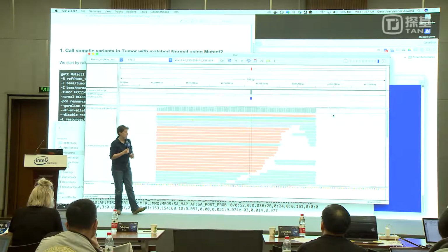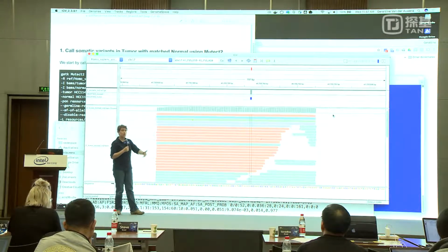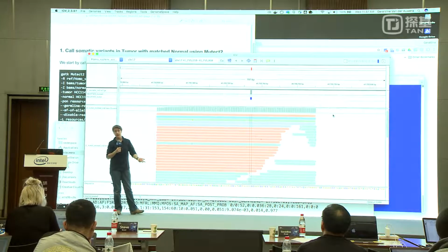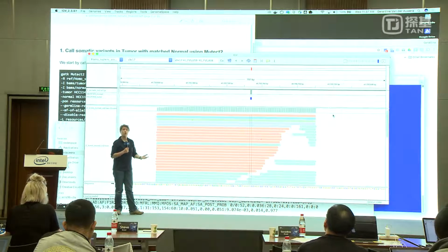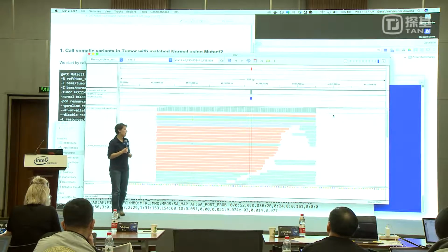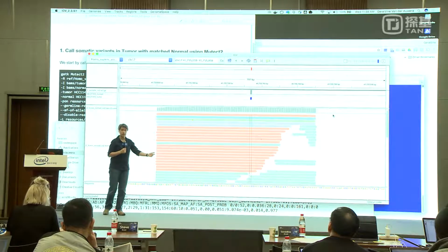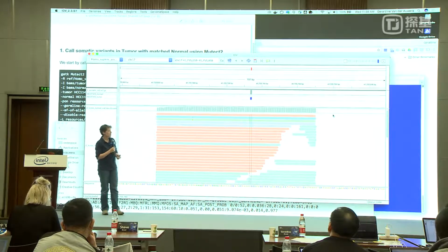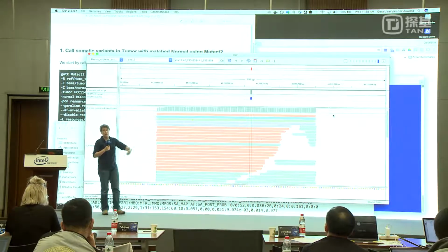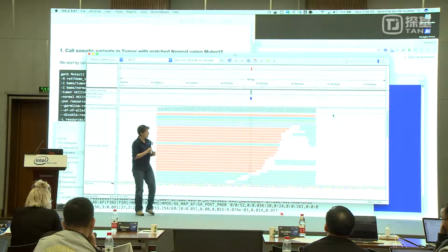in the region. And in fact, I'm not sure if we made that really clear, the underlying code in the GATK that does this is the same for Mutect and for haplotype caller. It's the same code that does the active region determination and the assembly. They have different parameterization to be more sensitive for Mutect, but they're ultimately the same machinery. It's only after, once you start evaluating what's on the haplotypes, that the two programs diverge. Okay?